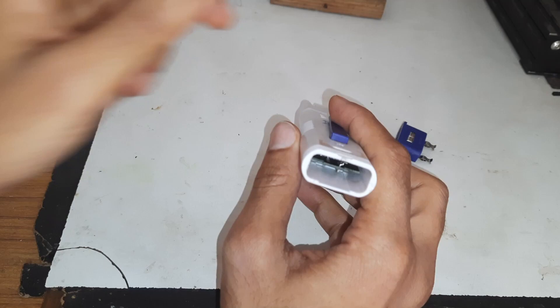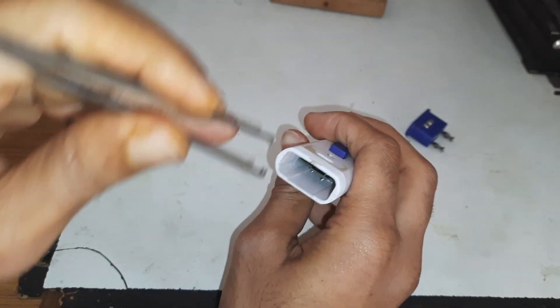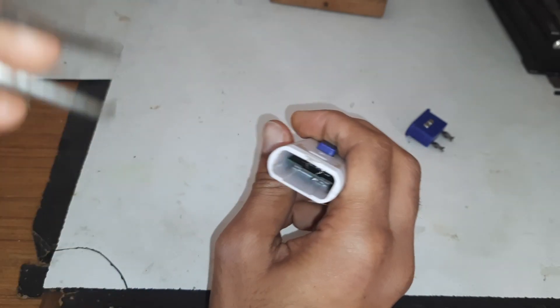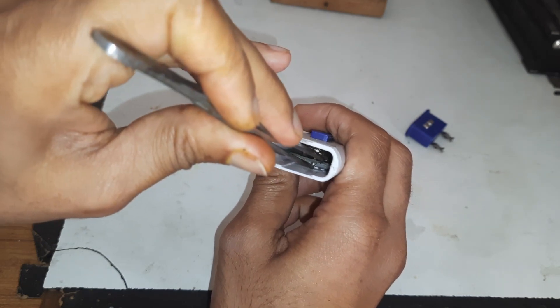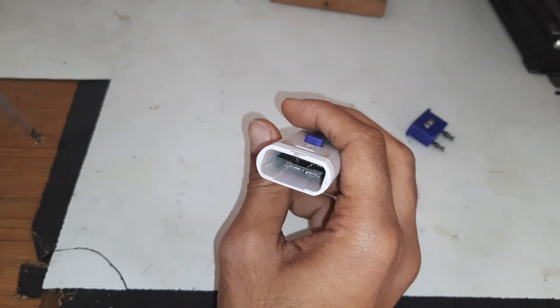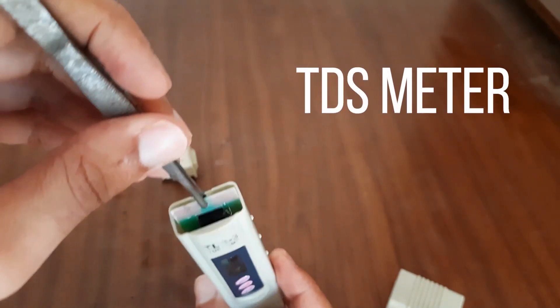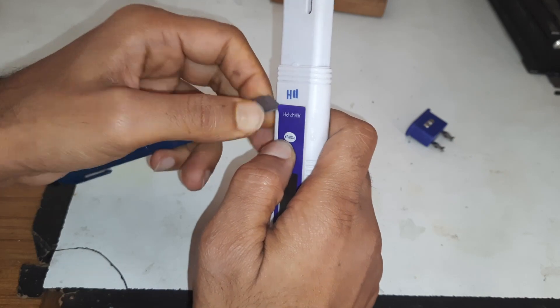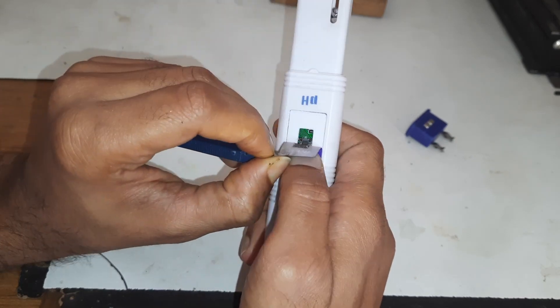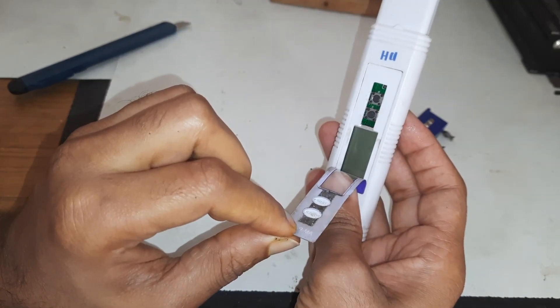Let's remove the circuit. I don't know how to get the circuit out — I tried to pick it with tweezers but it didn't work. I did the same with the TDS meter and it came out easily, but this pH meter has a different mechanism.